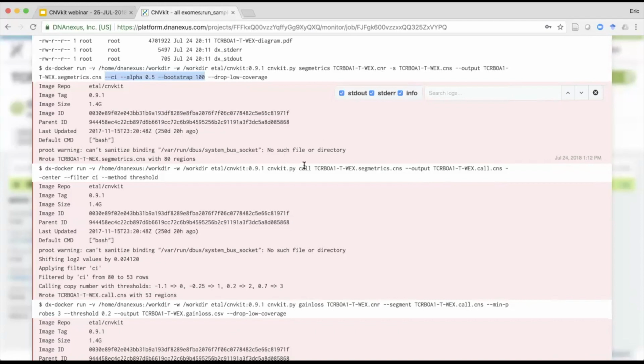And then in the next step, we use that segment mean here with the filter CI. If the lower or upper bound for a particular segment crosses 0, meaning the segment could plausibly have just been neutral, then we basically erase the segment breakpoints and merge it with the adjacent segments so that it becomes neutral in the output.